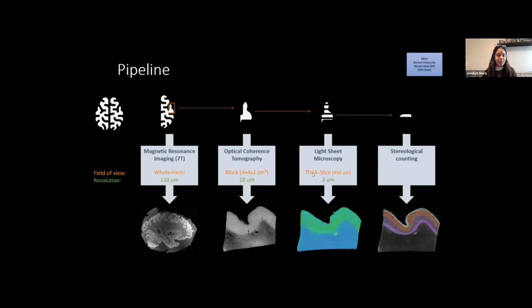Okay, so I'll just hop right in. I'm going to give a brief overview of the one pipeline that I had mentioned earlier, talk about the data that we have available on Dandy which resulted from this pipeline, and also talk about some data that we are planning to upload in addition to what we already have.